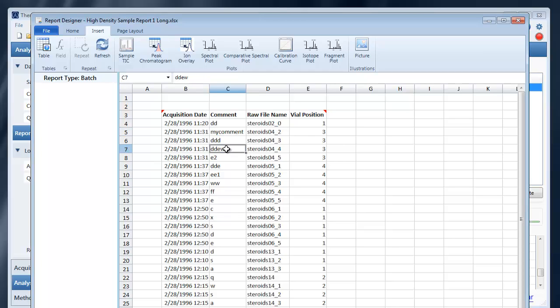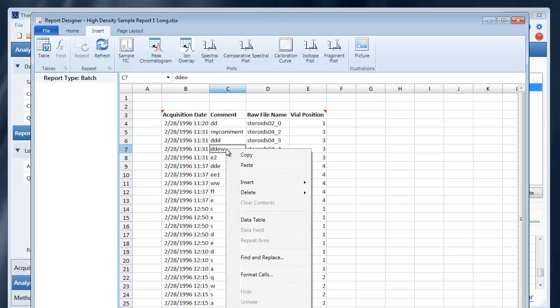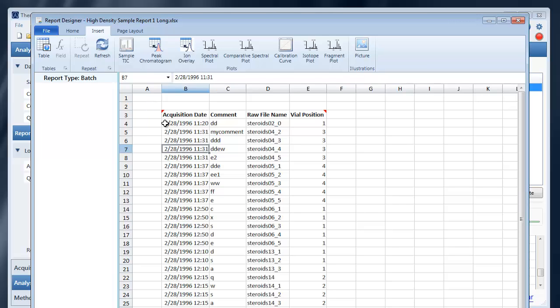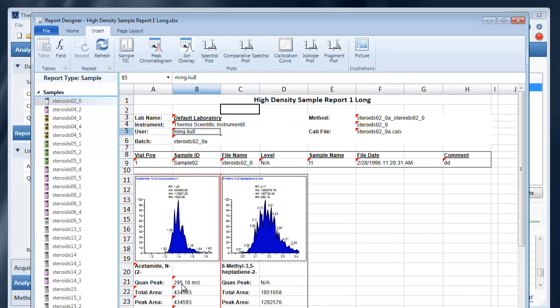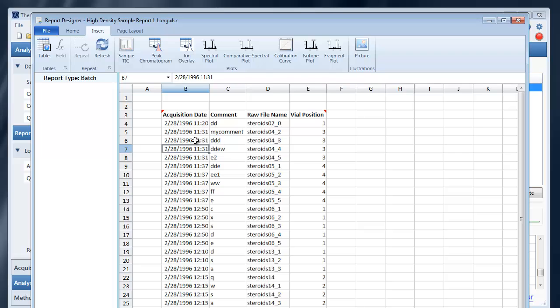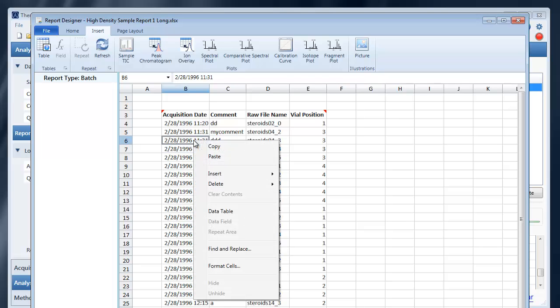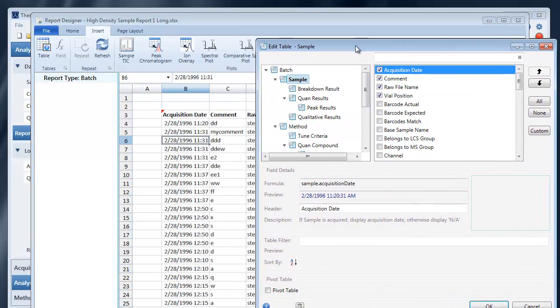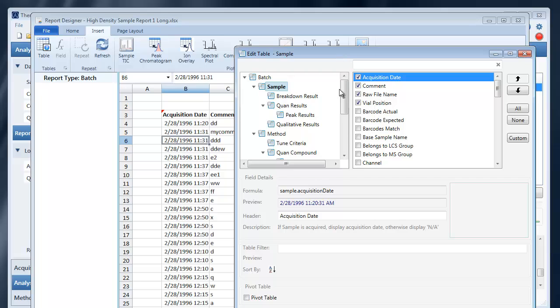A few tips about tables. To open up and edit the data table which is bound. You'll notice that bound data is delineated by these red shapes in the four corners of a table. You can't drag those. You'll notice that fields have a single delineated icon. To edit a data table, right click and choose edit data table.